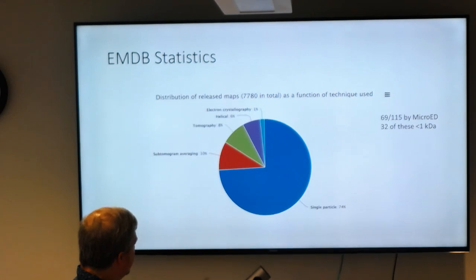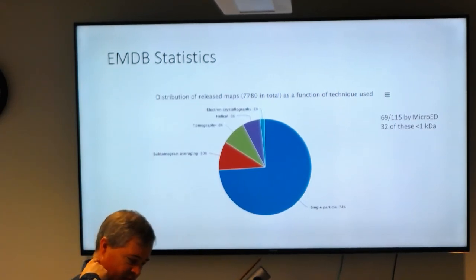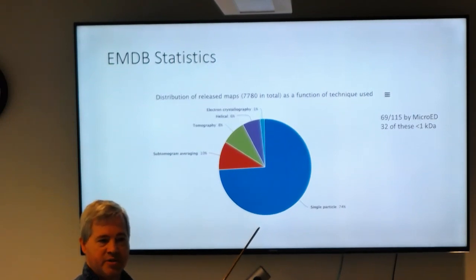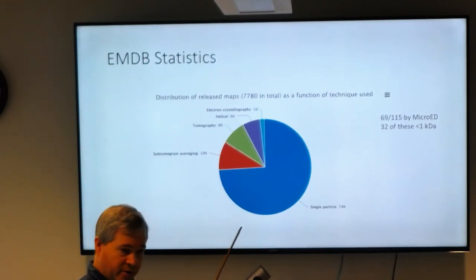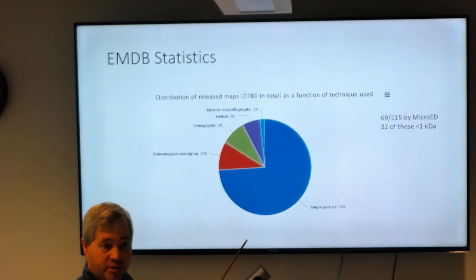So it does seem to be a technique which is becoming more popular. People are talking about it. Chemists in particular are interested in it. I'm not sure if it's ever going to be a big thing for protein biochemists, because our aim with single particle is to shrink things, to be able to image things smaller rather than be forced to make crystals again.